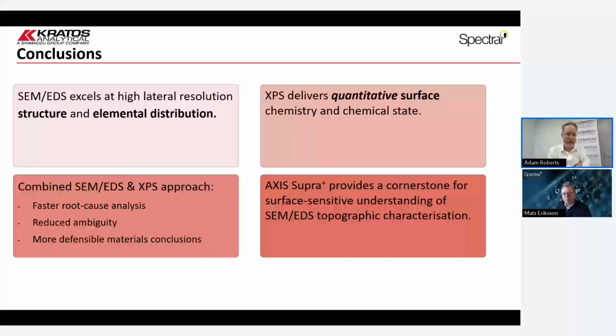So that's again where the real outermost layer of your material is dictating its application. I did notice, while we're still talking of depth information, one of the comments was, doesn't the depth of XPS depend on the X-ray energy? Yes, it does. Can't you just increase the X-ray energy instead of using EDS?